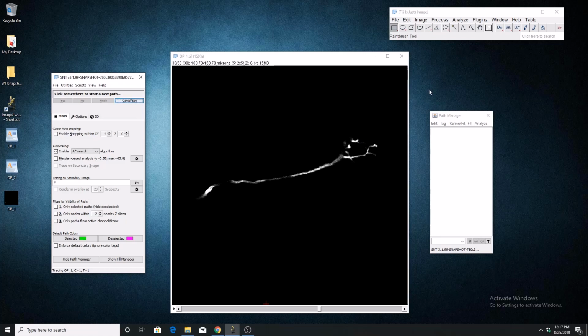Okay, so in this video, I'm going to go over some of the analysis capabilities that are found in SNT. And you'll see that I already have SNT open. And the first thing we need to do is import our reconstruction.